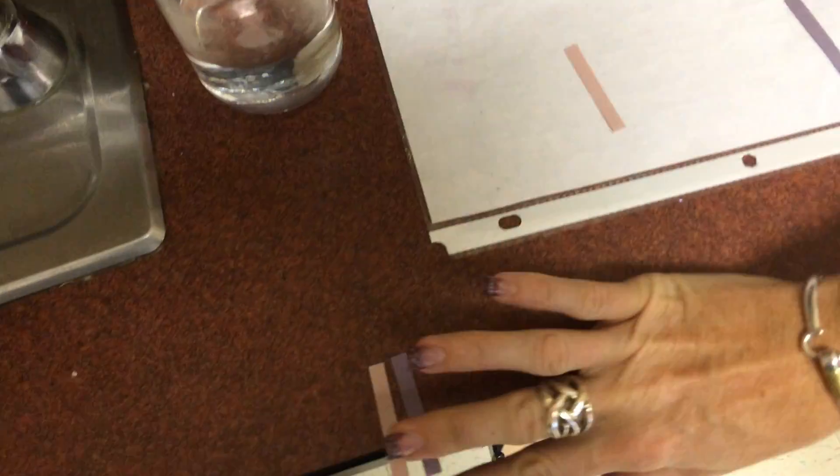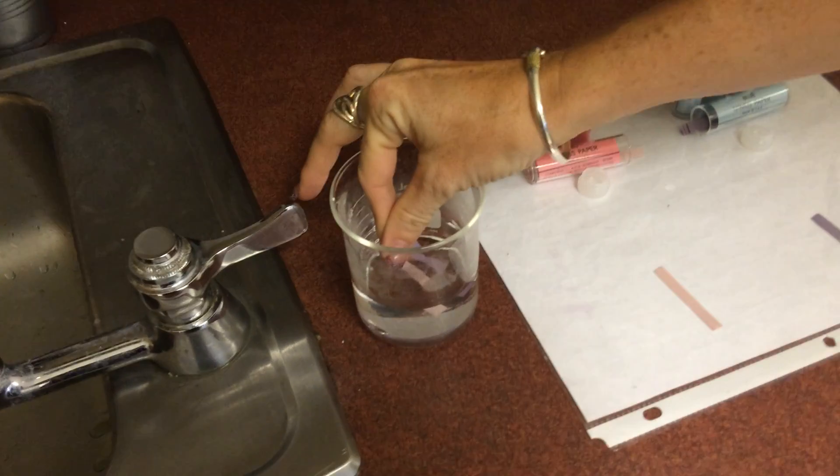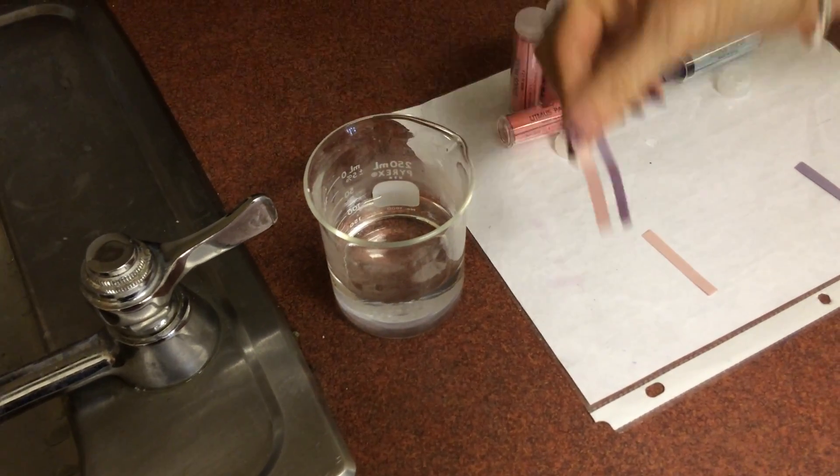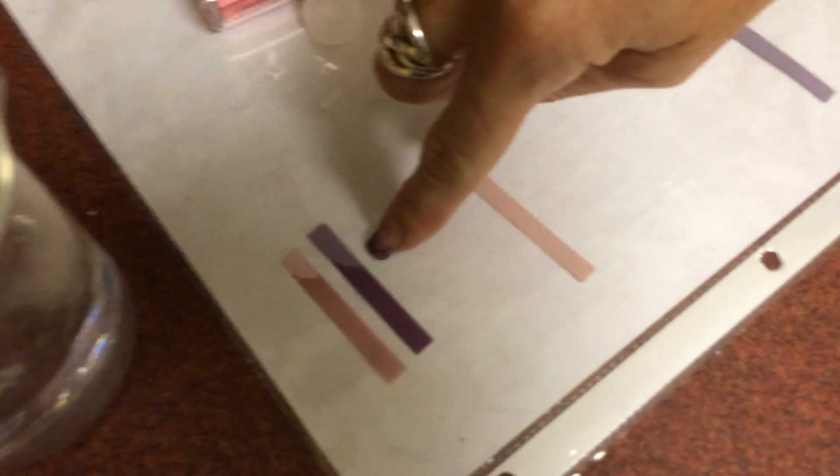To start off, we have learned that water is a neutral substance. So if I take the litmus paper and put it in the water, we can see that the pink stayed pink and the blue stayed blue.